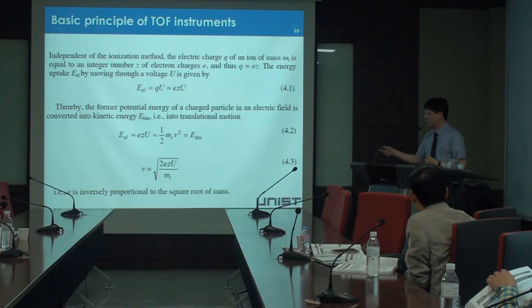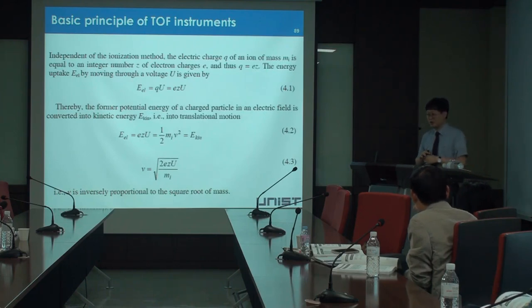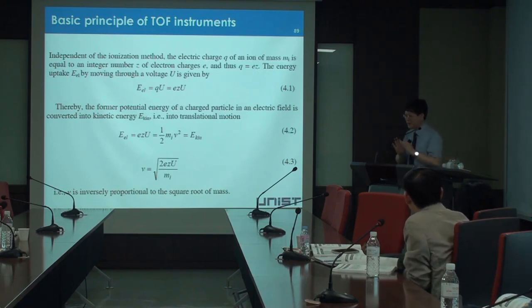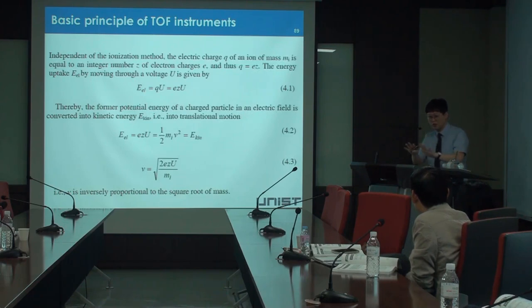Then the M, smaller molecules go fast, but large molecules go slow. Okay. It's the same as people. Big guy and small guy, I push with the same power, the big guy just stays there. The small guy goes to that location, right? The basic assumption is that you put in the same power. Okay? And then the moving speed can be changed.